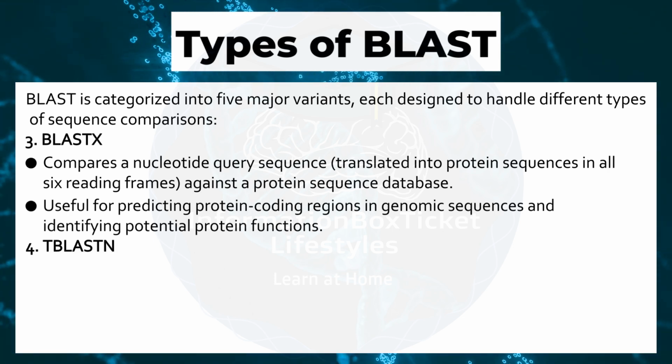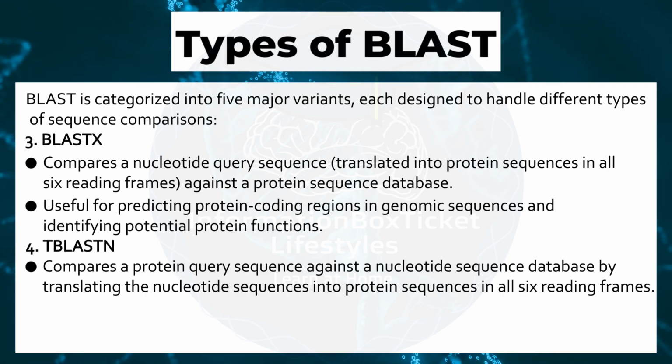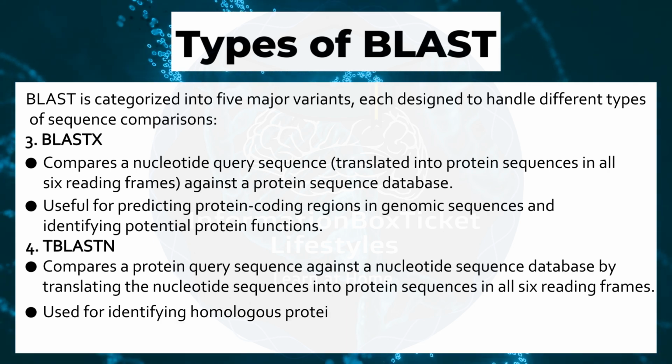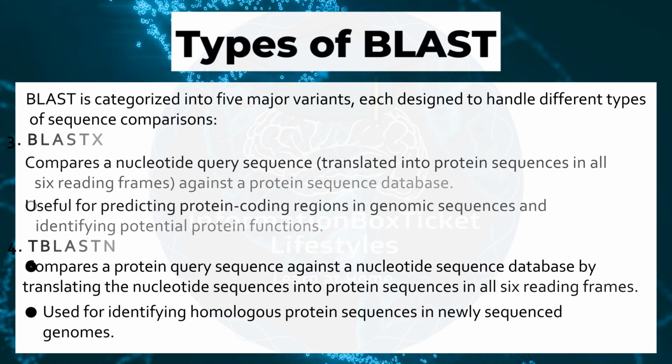4. TBLASTN compares a protein query sequence against a nucleotide sequence database by translating the nucleotide sequences into protein sequences in all 6 reading frames, used for identifying homologous protein sequences in newly sequenced genomes.